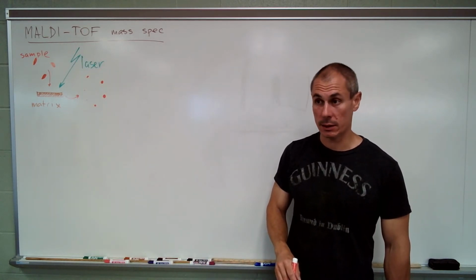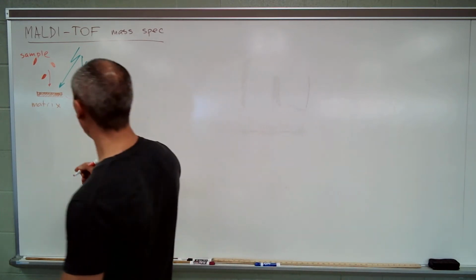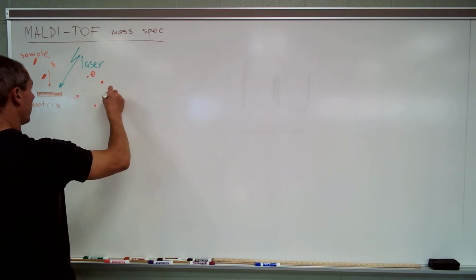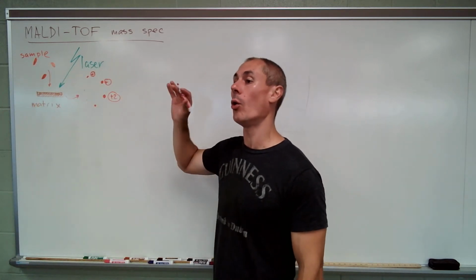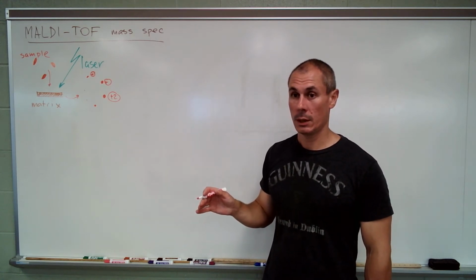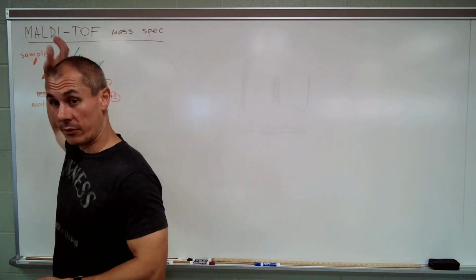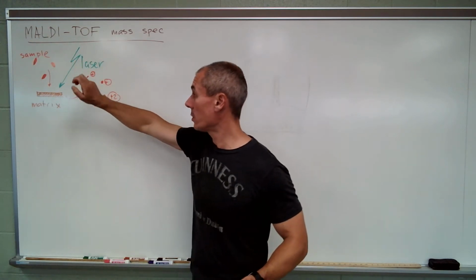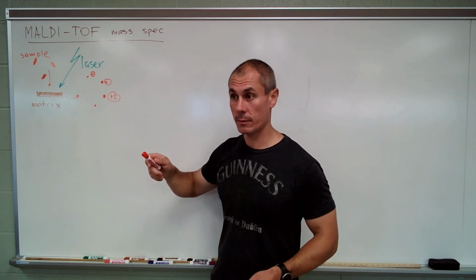Does that make sense? Is that understood? Like different positive charges. Maybe plus 2, I don't know. Okay, plus, whatever charges are. They're all going to be charged. So far, we deciphered MALDI. Matrix assisted, laser, desorption ionization process.